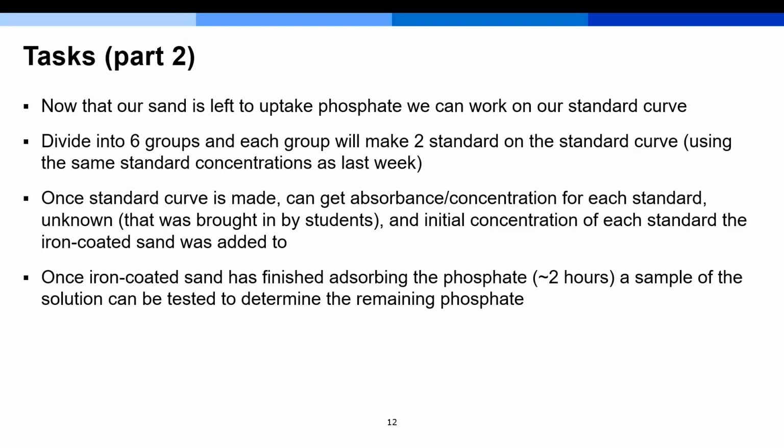They'll be able to determine the initial concentration of their phosphate solutions that they'll be making, and they'll also be able to test the final phosphate solution concentrations to see how much phosphate has been taken up by the iron-coated sand. So that's just the introduction for this lab, and if you're unable to attend the lab in person, I'll just now be showing a demonstration of what we actually did in this lab.